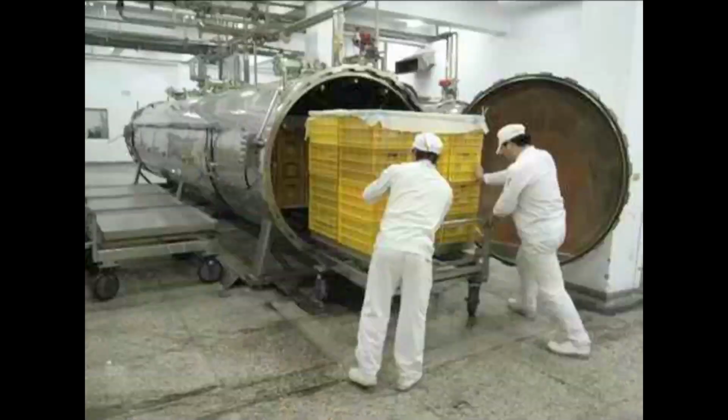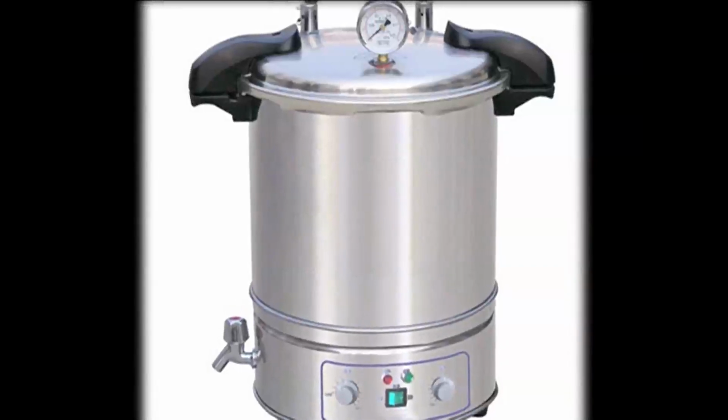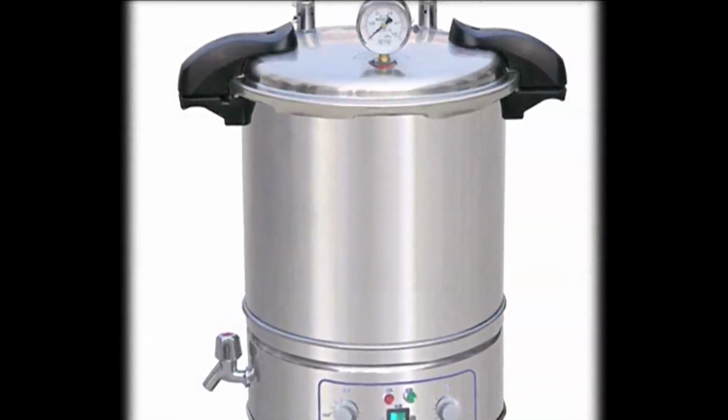autoclave chamber. Then the chamber is closed and the steam inside the autoclave starts increasing in pressure. With the increase in pressure, the temperature of the autoclave starts rising, and it is allowed to reach a temperature of 121 degrees centigrade and a pressure of 15 pounds per square inch. In this condition, if we maintain the things to be sterilized for 15 minutes, then all the endospores and viable microorganisms are supposed to be killed.